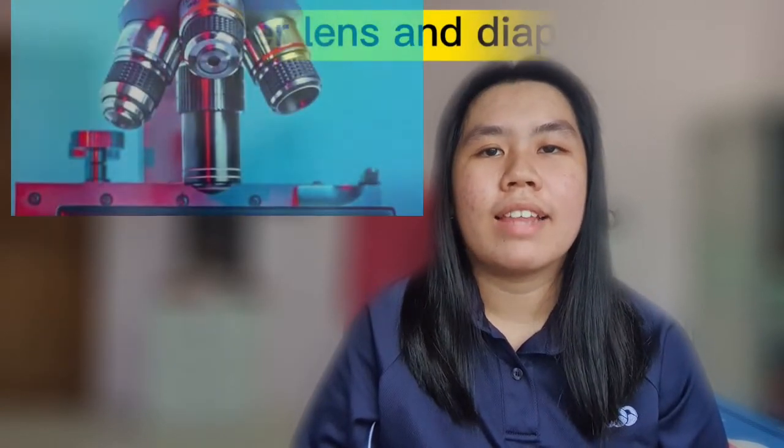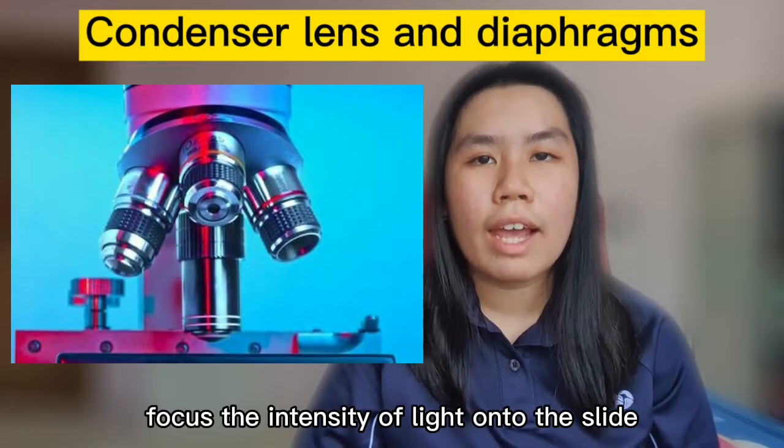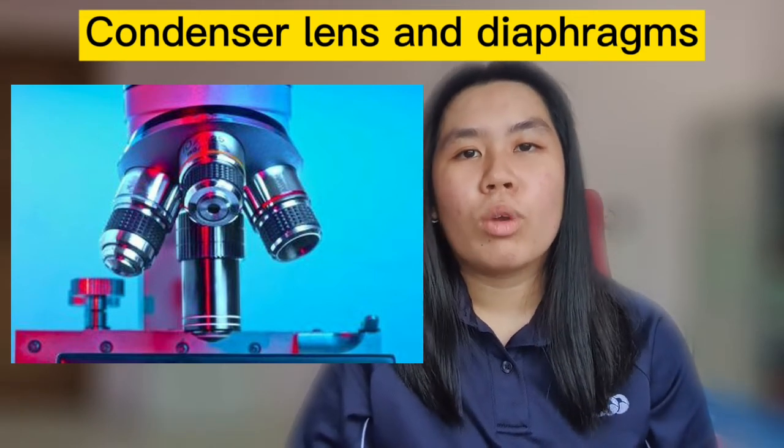Another part of the microscope is condenser lens and diaphragm. The condenser works with the diaphragm to focus the intensity of light onto the slide containing the specimen. These parts are located under the microscope stage.